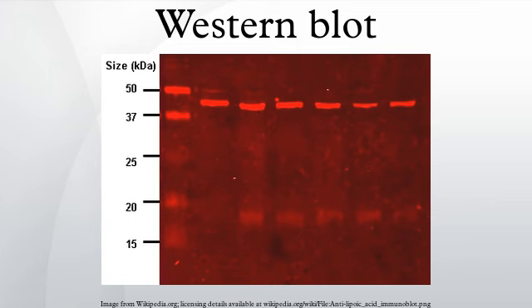The protein in the dilute solution attaches to the membrane in all places where the target proteins have not attached. Thus, when the antibody is added, there is no room on the membrane for it to attach other than on the binding sites of the specific target protein. This reduces noise in the final product of the Western blot, leading to clearer results, and eliminates false positives.